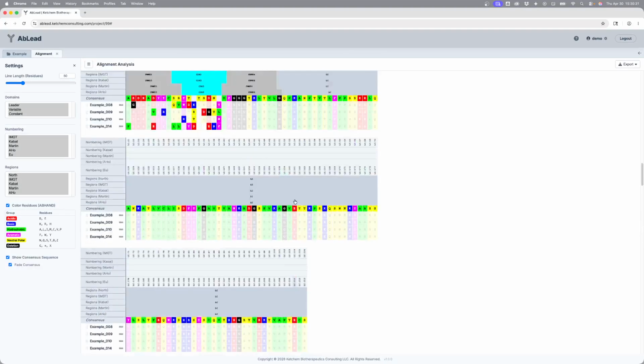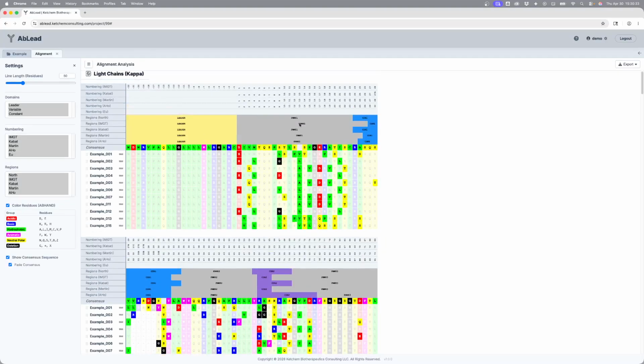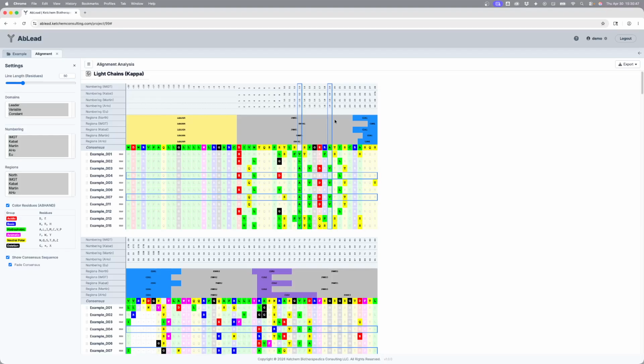If a residue is selected for evaluation, you can just select on a residue number and it draws a box. Simultaneously, you can do this with multiple entries as you wish. These are toggles, and so it helps you visualize where in a molecule your eye needs to focus for comparison. It's a pretty handy tool for an electronic lab notebook or for a report generation.